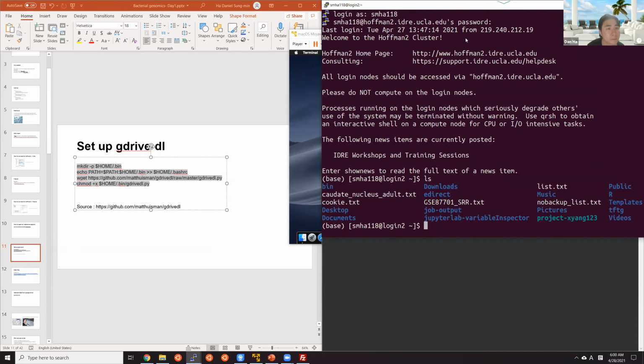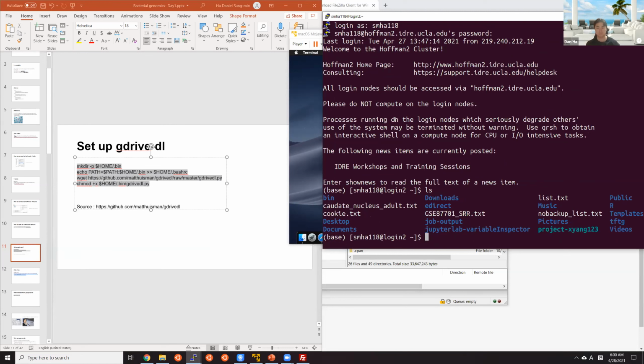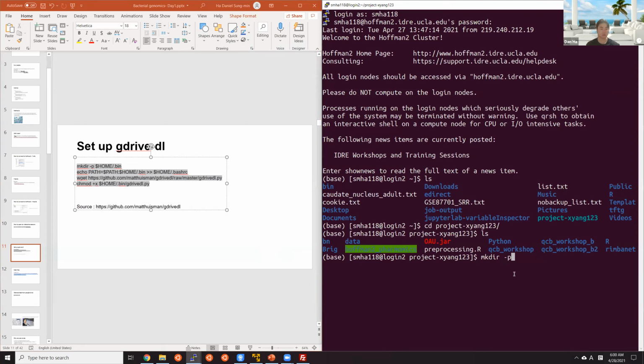Okay. So let's redo. Sorry. So mkdir -p. Just retype it real quick.